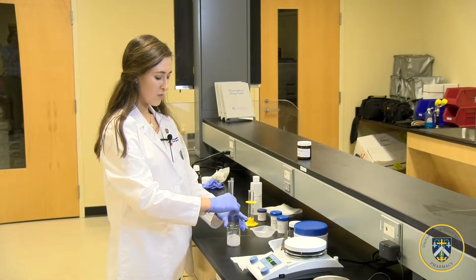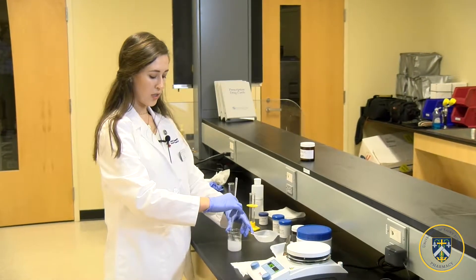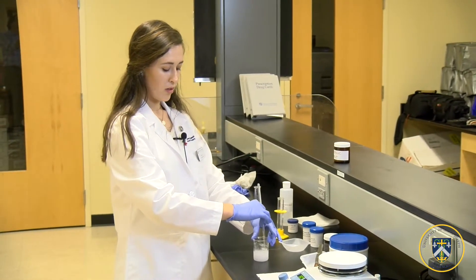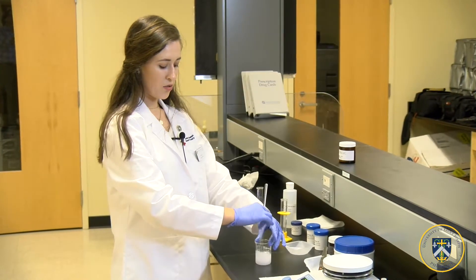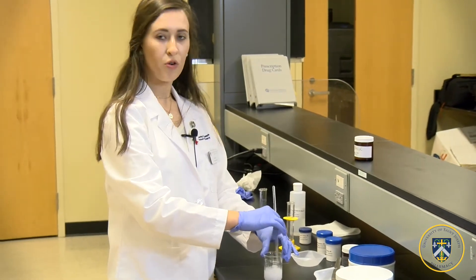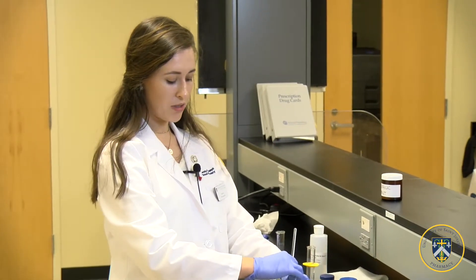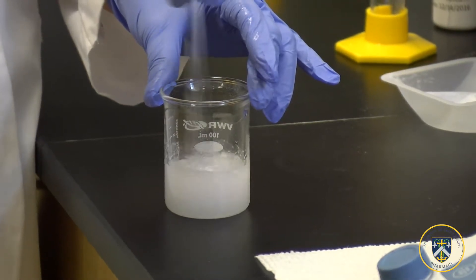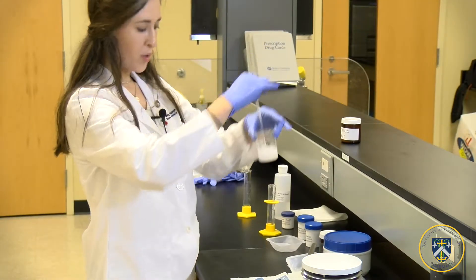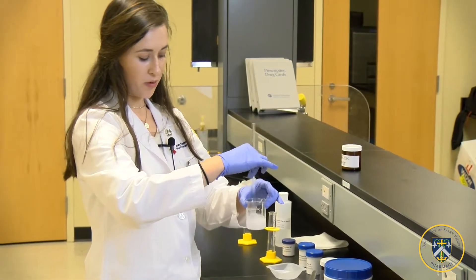Now we'll mix our second beaker — the water mixture — until everything has dissolved and we get a uniform solution. This mixture includes our preservatives, emulsifiers, surfactants, and our diluent. Our mixture is becoming more uniform; it is cloudy but everything has been mixed.